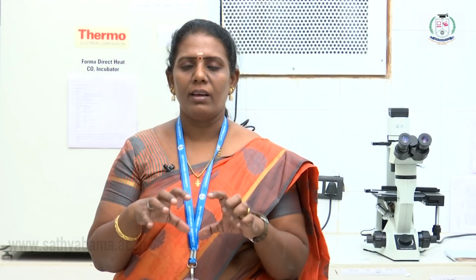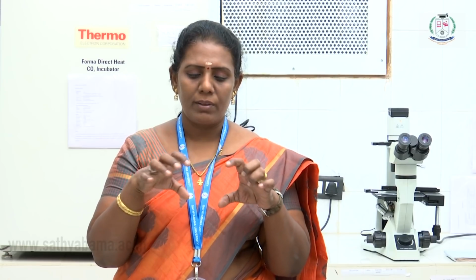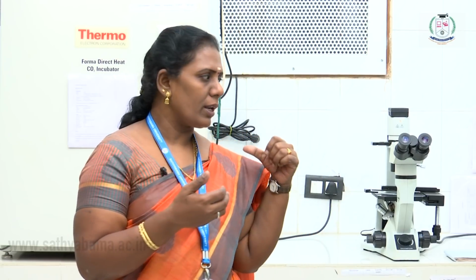Next, we have to view the cells regularly. That is, if you do a subculture one day, we have to see the cells on the next day. The viewing is to check whether they are live or dead, and that has to be done using a variety of microscopes. Here we have to use an inverted microscope. The light is coming from the top to down. In the rest of the microscopes it is the reverse, so this one is called inverted. Otherwise we can call it the light microscope or inverted microscope.